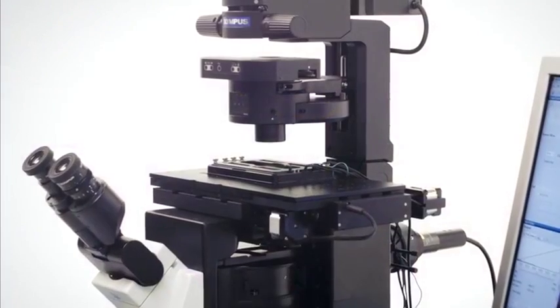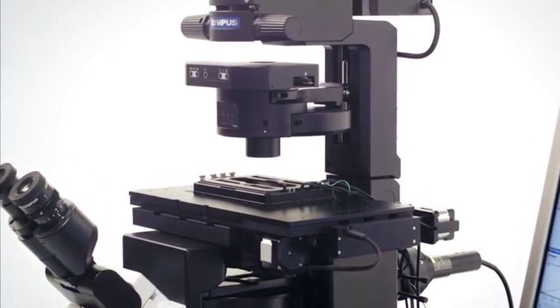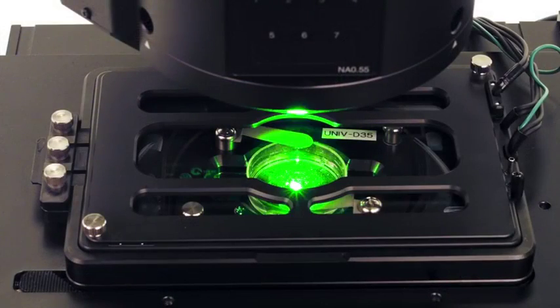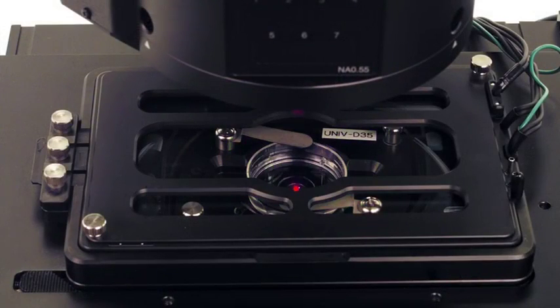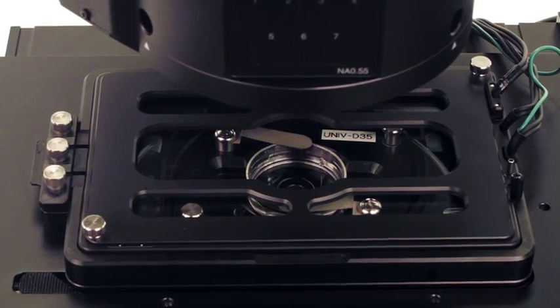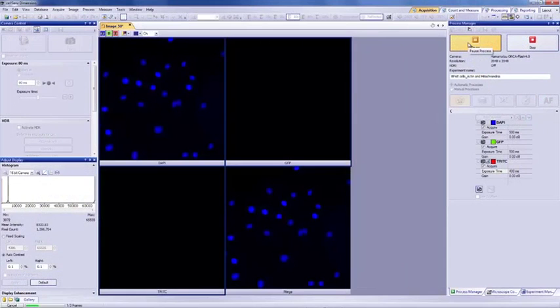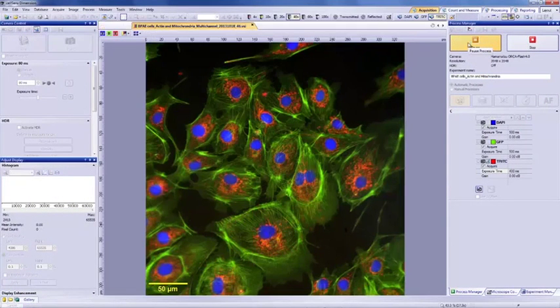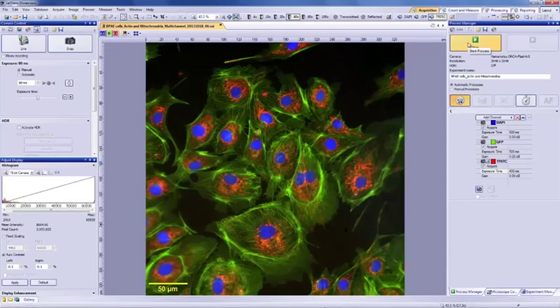The IX-73 Semi-Automated Microscope also provides an easy entry to time-lapse experiments. Both the motorized filter turret and condenser contain built-in automated shutters to prevent specimen exposure between time points. Combined with the Experiment Manager and the CellSense software, advanced acquisition protocols are made easily accessible to even new microscopists.